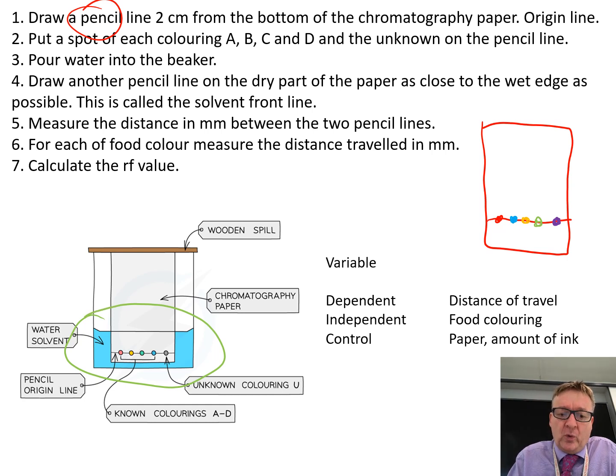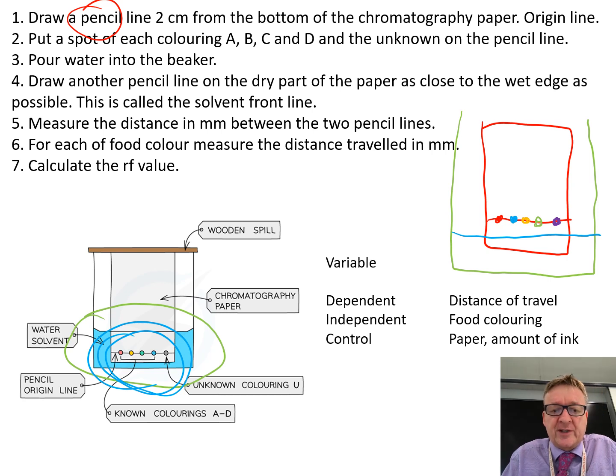Make sure the water doesn't go over the top of the spots. I'm going to draw my beaker and put my water across there using blue. Obviously, if you put your dots underneath the actual water itself, they're just going to dissolve into the water.